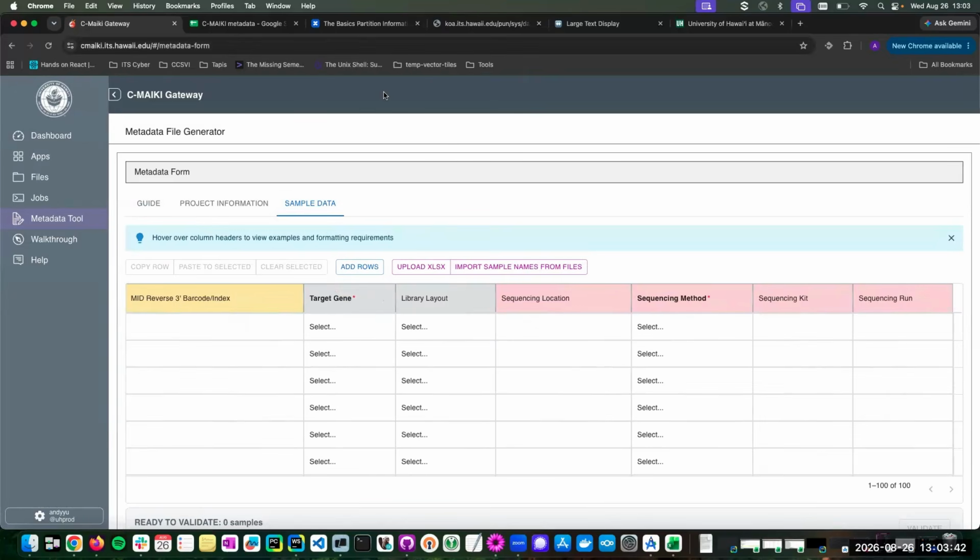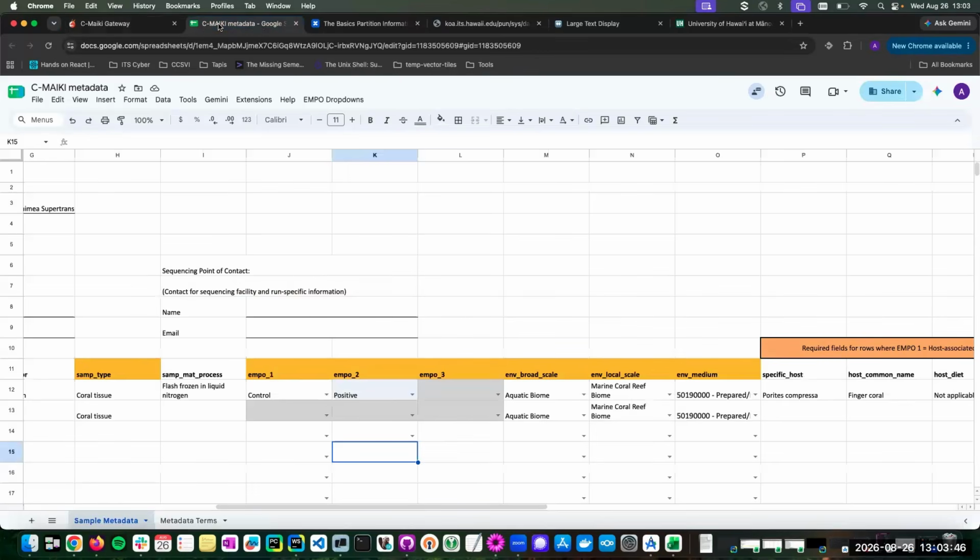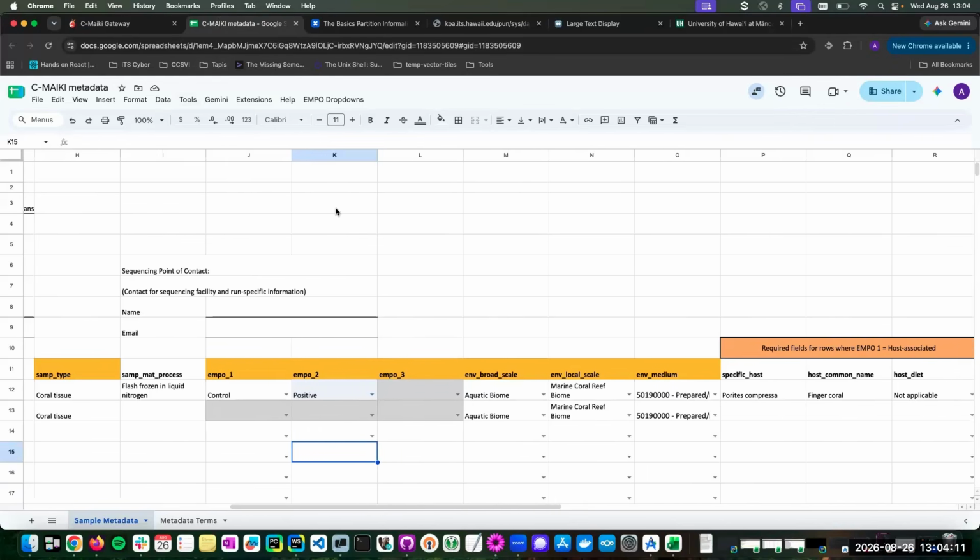Data, but then you could have your own treatment columns, or pesticide columns. So if you were to make your own copy of metadata, this one, the form we recommend everyone start with, yes, you can add your own columns and you can upload that exact spreadsheet up. The tool would not ingest those columns that you've appended because we're not looking for those, but we also won't reject your metadata file if you have a whole bunch of extra ones. So it's, I guess, open-ended in that regard. So like for your own records.